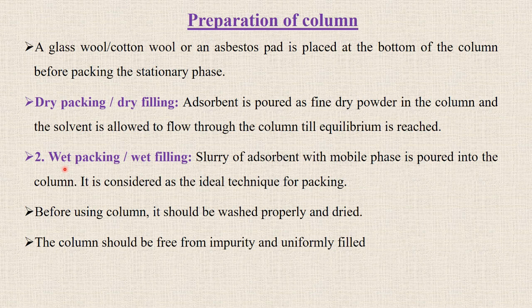So to avoid that problem, wet packing or wet filling is used. In this process, a slurry of adsorbent with mobile phase is prepared and poured into the column. It is an ideal technique for the packing because it gives more homogeneous packing. And before using the column, it should be washed properly and dried, and it should be free from impurities and uniformly filled.